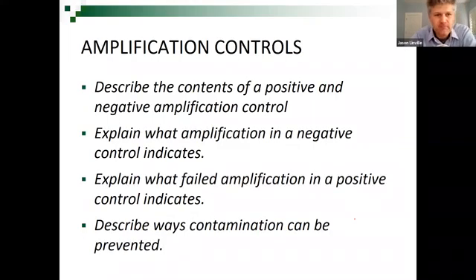Okay. All right. The last thing I want to talk about, so notice there we have another transition into a learning objective slide. Okay, so we're going to talk about what a positive and a negative control is.